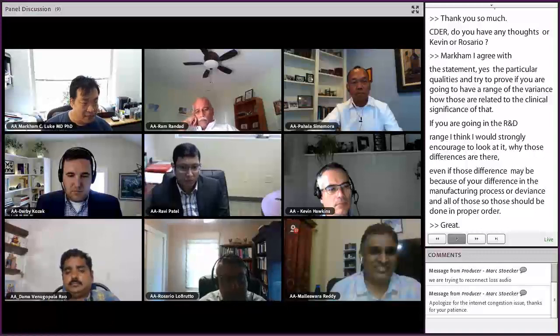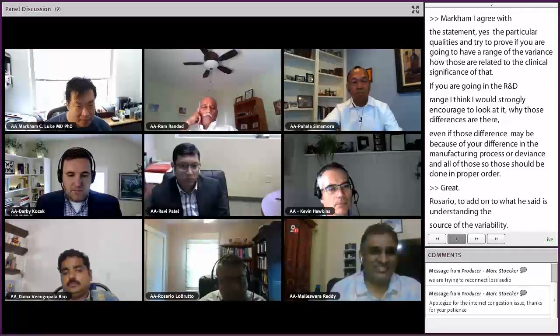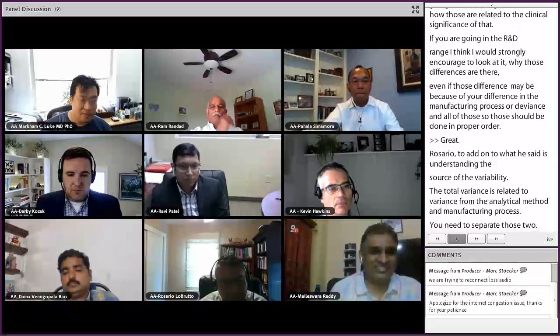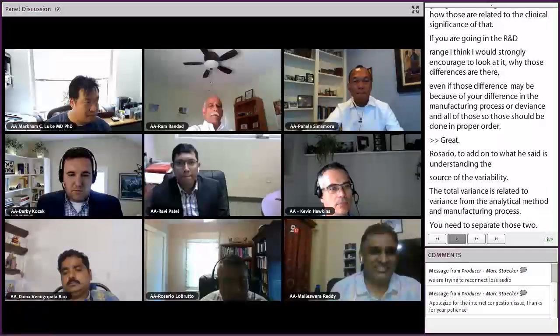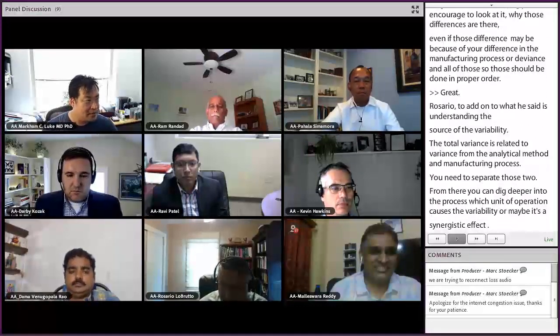Then you need to dig deeper into the manufacturing process to find which unit operation is causing that variability, or maybe it's a synergistic effect and you need to have the right control strategy. On the other hand, with an analytical method, is it the measurement itself that is causing the variability, or is it the sample preparation? So I think the aim is to reduce the variability and, obviously, to be within that of the RLD at the end of the day. Hopefully that provided some additional insights.